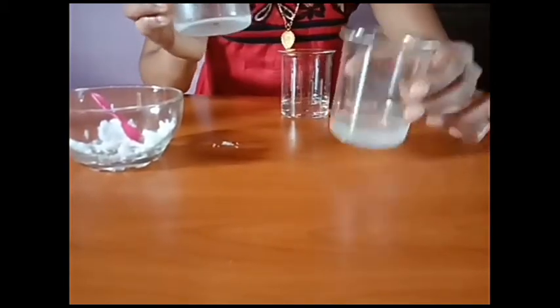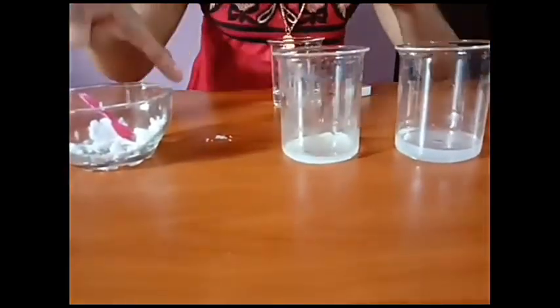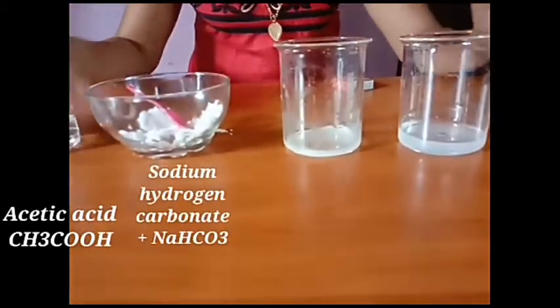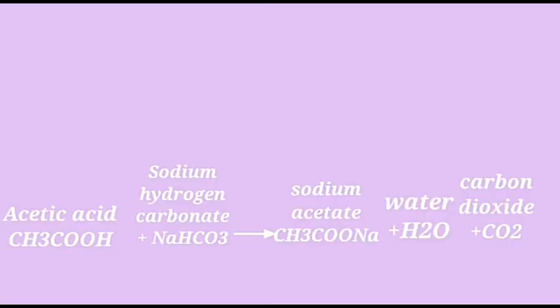The reaction is: acetic acid plus sodium hydrogen carbonate, that is CH3COOH plus NaHCO3, gives sodium acetate (that is the salt), plus water, plus carbon dioxide — CH3COONa plus H2O plus CO2. That is the reaction.